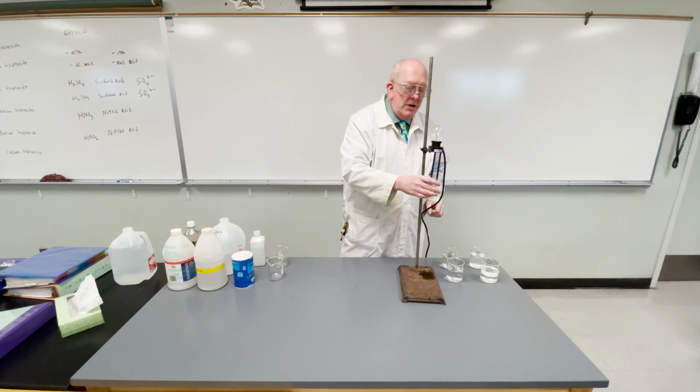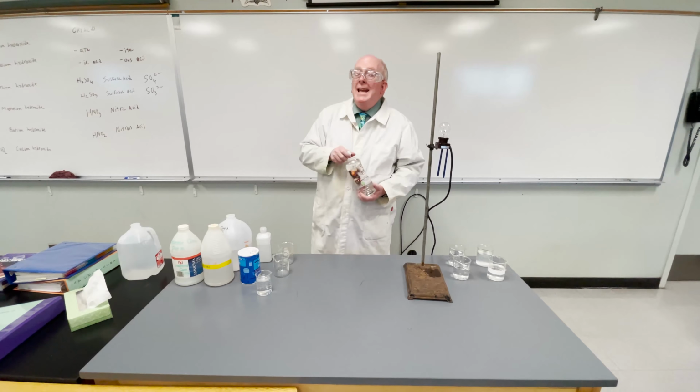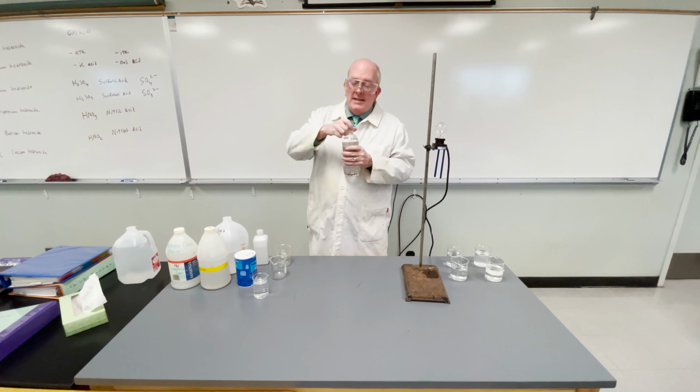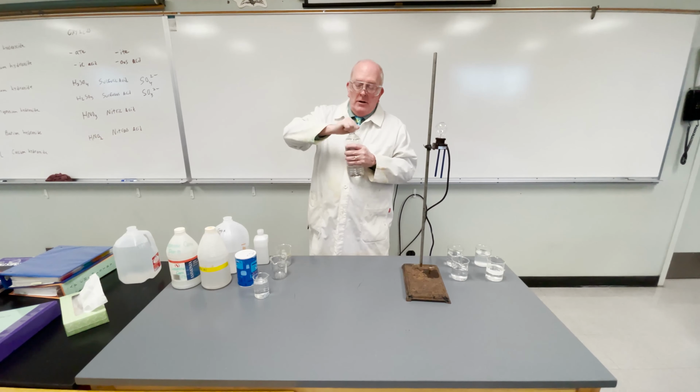Now, I also have examples of weak acids and weak bases. This is just classic distilled vinegar. This is the same stuff you have at home. This is white vinegar. The reason I use it in the lab is that it's easier to see into it, to see what's going on, okay? At home, I typically actually don't use that one.